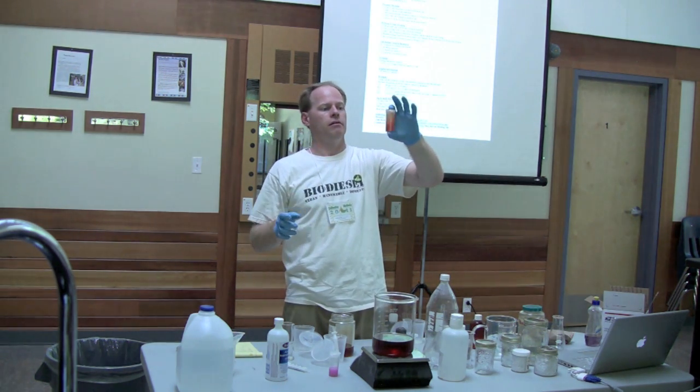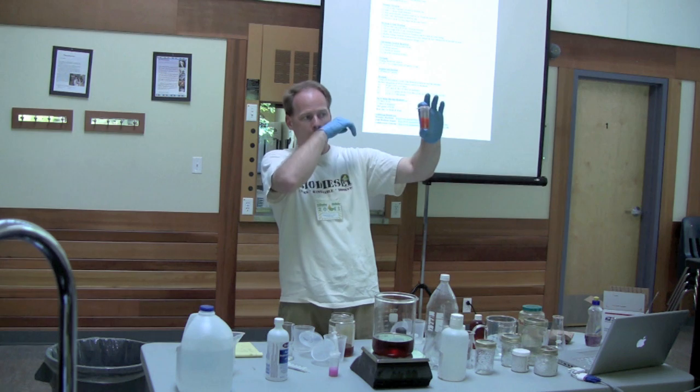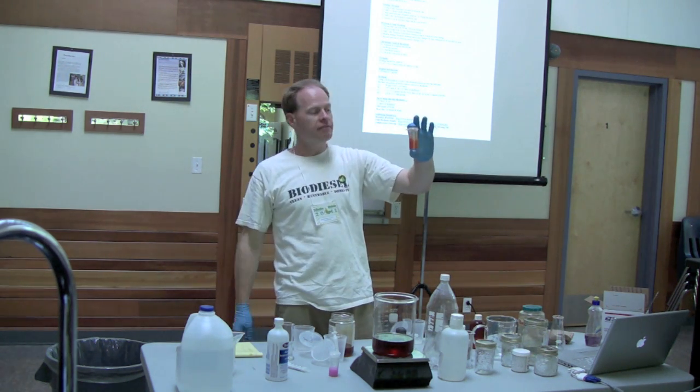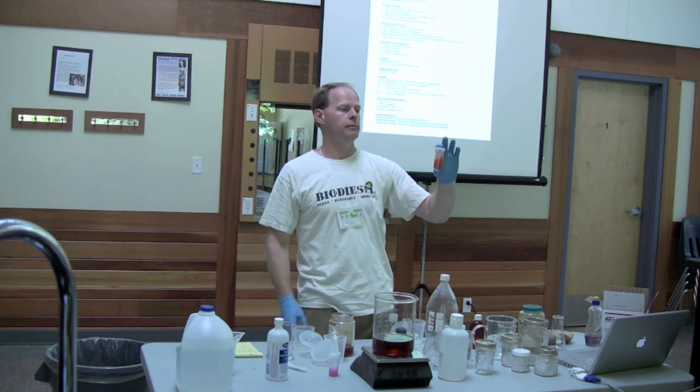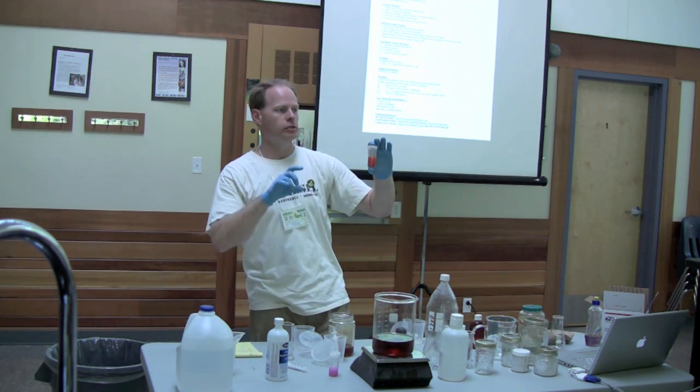In your experience, though, is either one of those indicators more reliable? I'll be honest, I haven't used turmeric a lot lately. It's something new to me. I've always used phenolphthalein, and I know it's always bang on and it works.